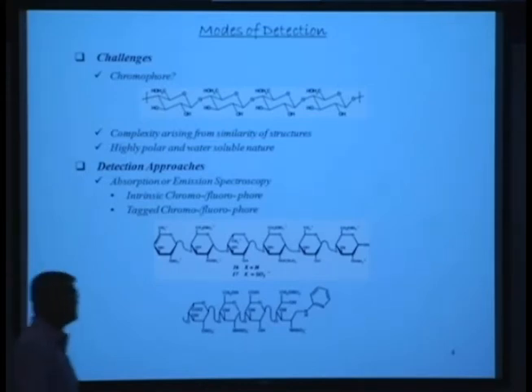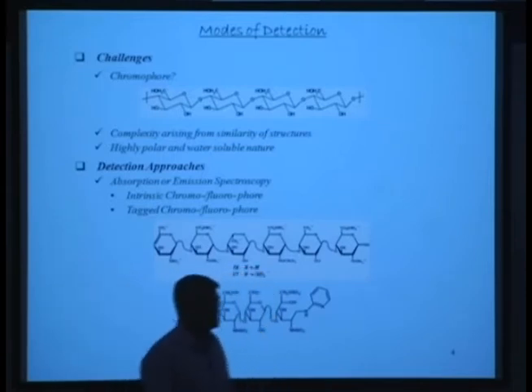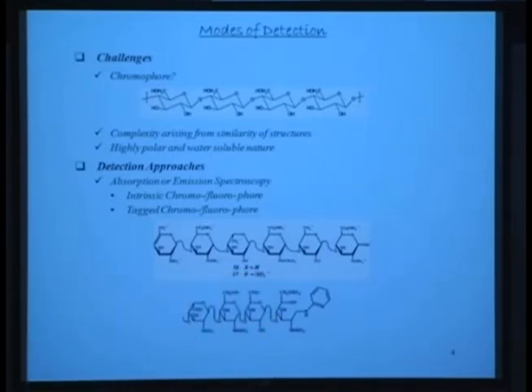Go ahead. So they do scatter light? They do, yeah. So if you have enough heparin in solution, the detectability, by the way, yeah, absolutely. The detectability is not very great, but you can still use it, sure.